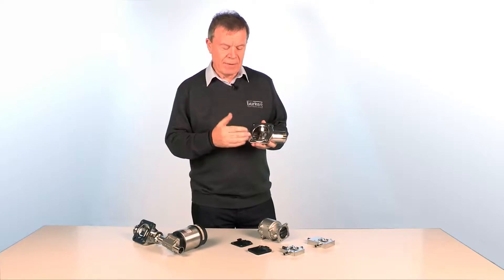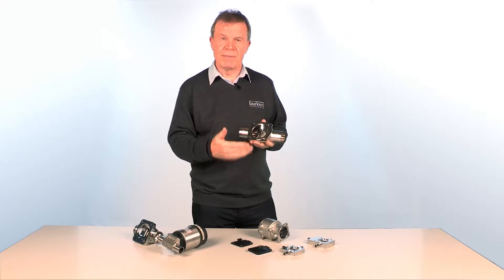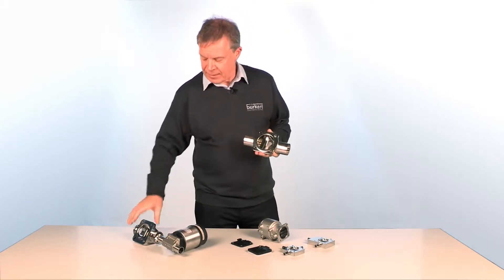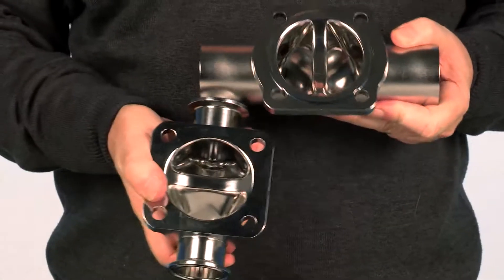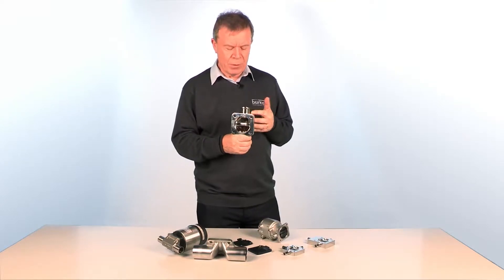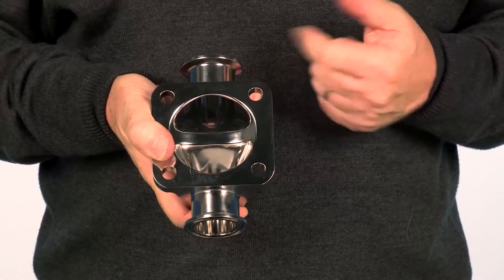One of the issues with the diaphragm valve is that it is purely a two-way valve. If you want to get some sort of divert function, you have to join two diaphragm valves together in a manner such as this. Unfortunately, that creates a dead volume. If this is water, it can become contaminated with bacteria; if it's product, that is a waste product and a loss of money.